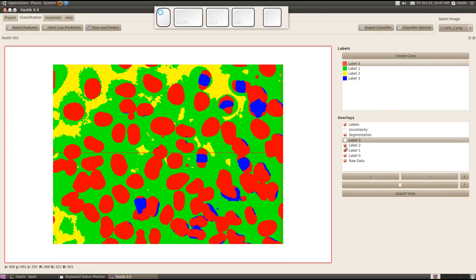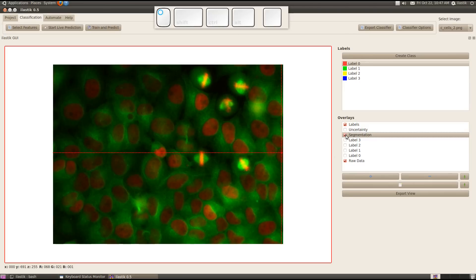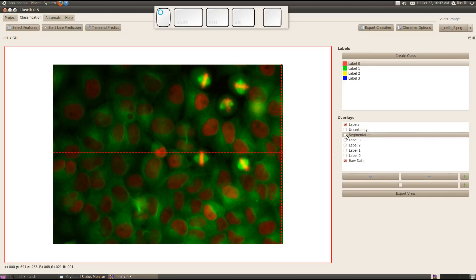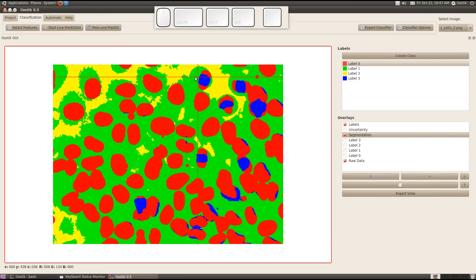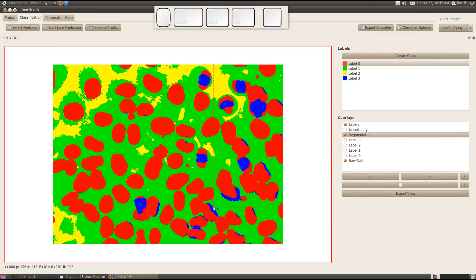I disable the overlays and look at the raw data. As you can see, those mitotic cells over here are correctly detected. But there is also some false detection down here and here maybe.